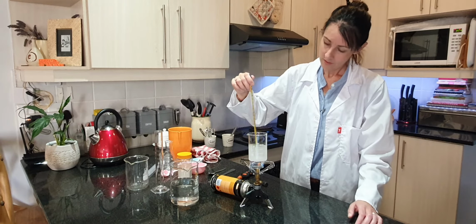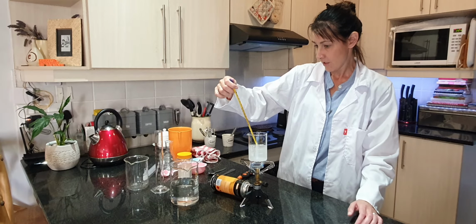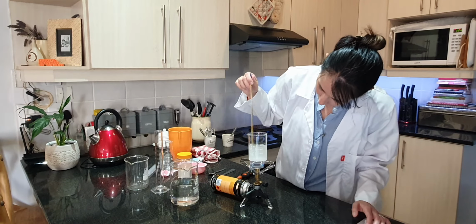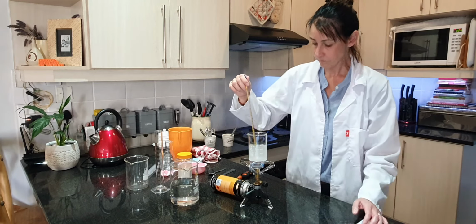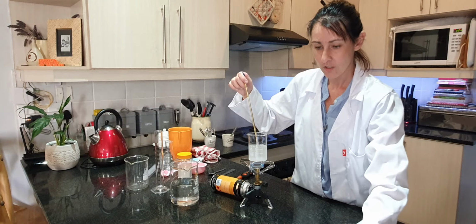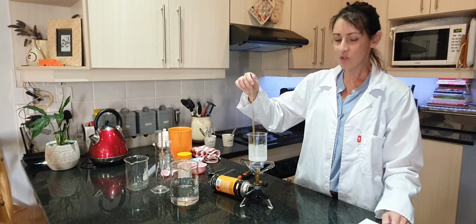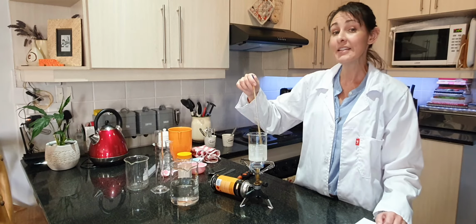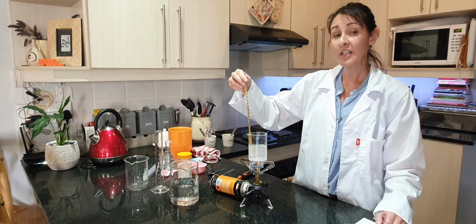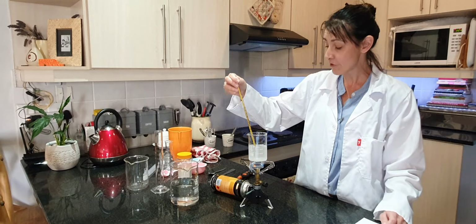Okay. And we are on 57 degrees already. Let's check to see if we are getting any bubbles. In the meantime, I just want to go down your practical here and see. Okay, so they want you to answer questions like, what is the boiling point? You need to explain what the boiling point of a substance is. So please go and look it up in your books. Ask Google if you have to.